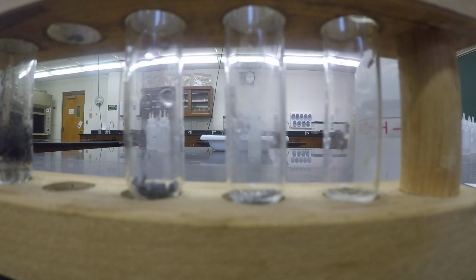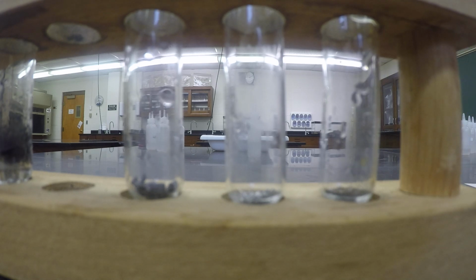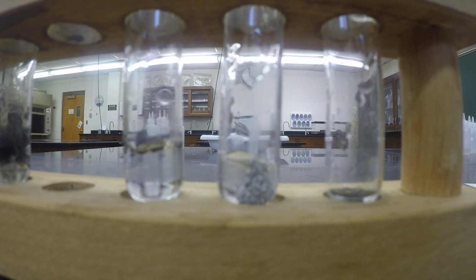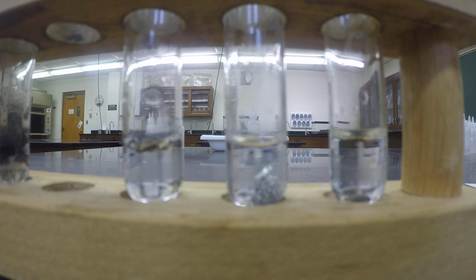Okay. And I'm going to add some base. This is KOH, potassium hydroxide. Okay, and again, you're looking for bubbles. Let that sit for a second. And I don't know if you can tell, but it is not doing anything.